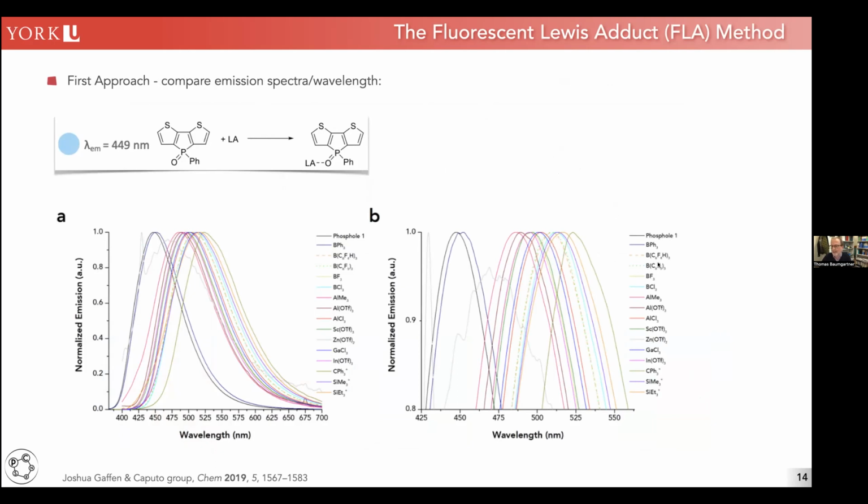Here's a couple of dashed lines that I would highlight. So one of them is, again, our BCF, the perfluorophenyl borane, but also a species where the para-fluoro in the phenyl groups of BCF is replaced by a hydrogen. So minor change, this is a para-hydrogen substituent. And if you look at the two curves, they're almost identical. But people have established in the past that no, they actually have a slight difference in Lewis acidity. They're close to each other, but they certainly have a different Lewis acid strength. So just looking at the emission maximum doesn't really help here.